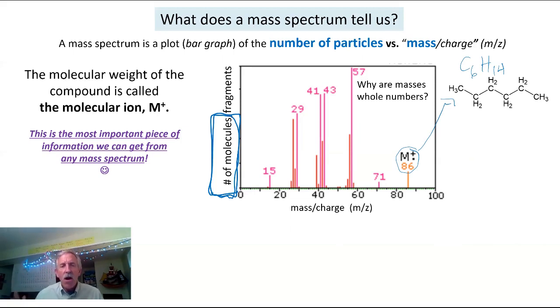So all of these numbers up here are based on the averages of the isotopes of all these atoms in nature. So for example, carbon is mostly carbon 12, about 99% in the world is carbon-12, and there's about 1% carbon-13. So the periodic table says that the average atomic mass of carbon is roughly 12.01.